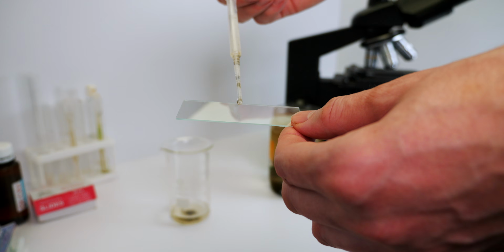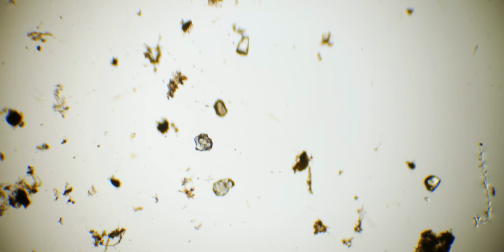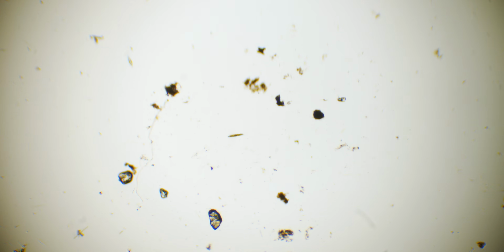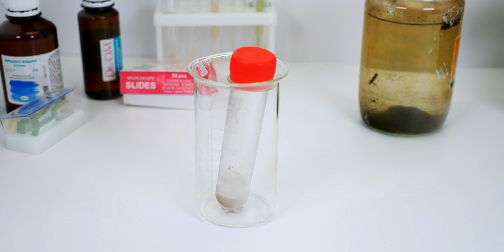We take some boiled water with a pipette and place just one drop on a microscope slide. Then we put the slide under the microscope. So far, all we see is a lot of microscopic grains of sand that look like transparent stones, with plenty of microscopic debris around them. I don't see any signs of life in the boiled lake water. And that means it's time to test the frozen water too.